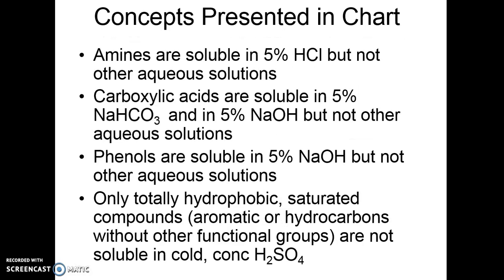You should know these basic solubility principles, but it doesn't hurt to review them. Amines will dissolve in 5% hydrochloric acid. Carboxylic acids will dissolve in either sodium bicarbonate or 5% sodium hydroxide. Phenols will dissolve in 5% sodium hydroxide only, not in sodium bicarbonate.